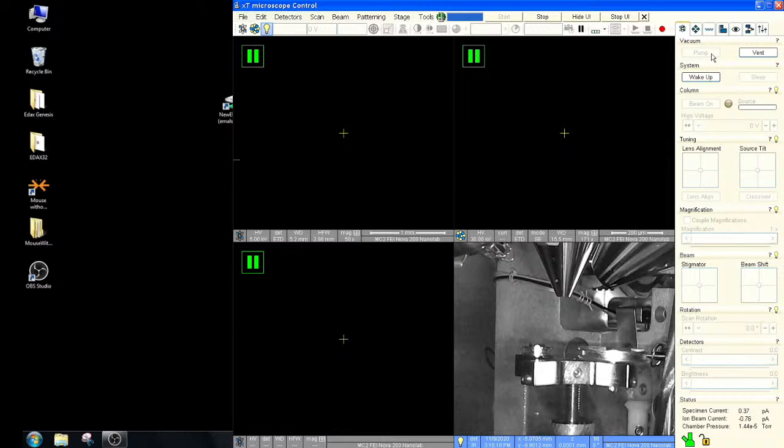Now, for those of you who are not familiar, if you're watching this later, this particular microscope, the Nova, is a little bit older FEI dual beam instrument. It has both focused ion beam and the SEM column. And the SEM on this is a pretty high resolution SEM, definitely resolutions down to around a nanometer spatial resolution. And it's a very good workhorse SEM, even without the FIB.